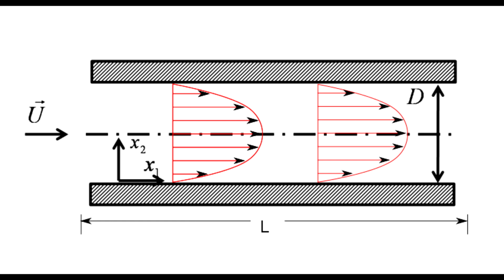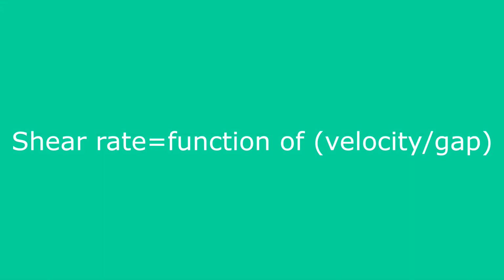Objects suspended in the flow are subjected to shear as different layers of the flow are moving at different velocities. The higher the flow velocity, and the smaller the gap, the greater is the shear rate and thus shear stress available to overcome a cohesive force like surface tension. Once the cohesive force is overwhelmed, objects like oil droplets in water are ruptured into smaller droplets. This goes on until the shear and surface tension forces come back into balance.